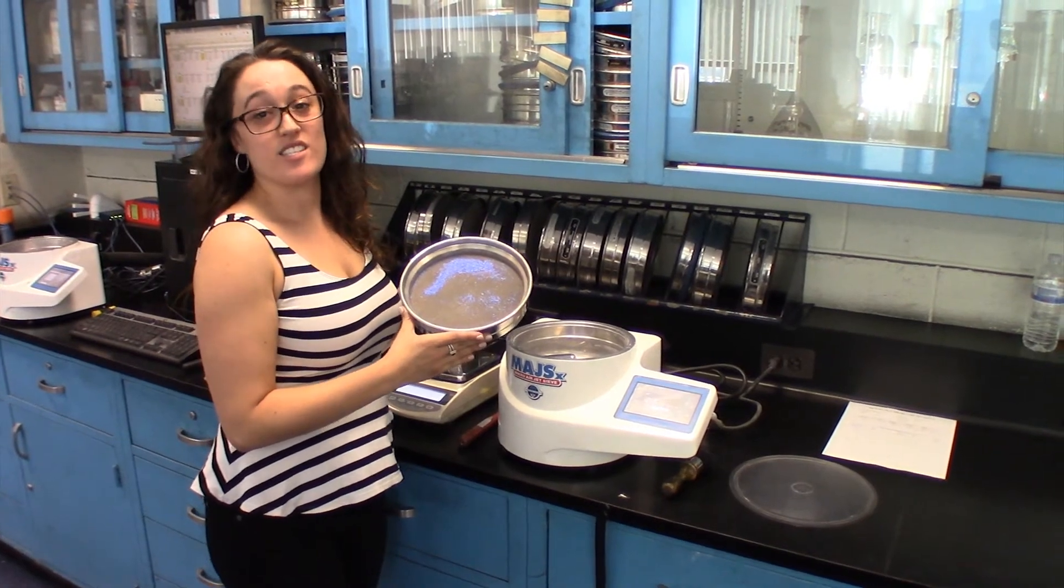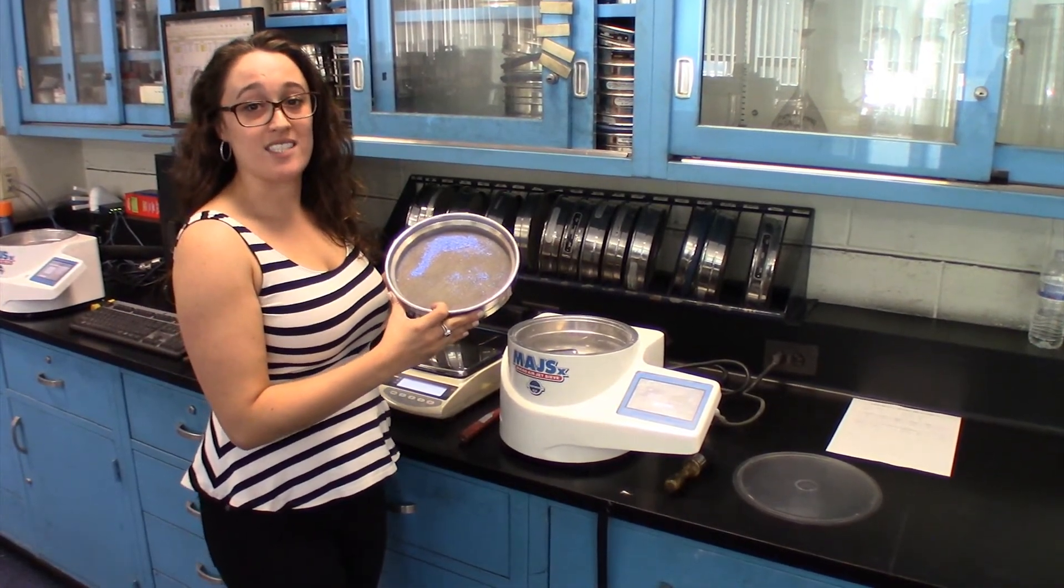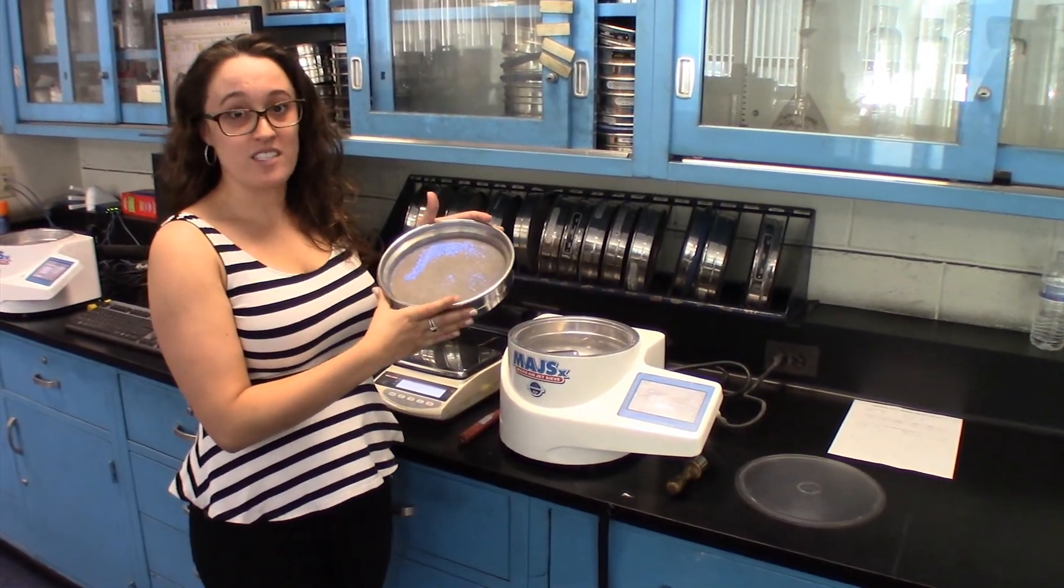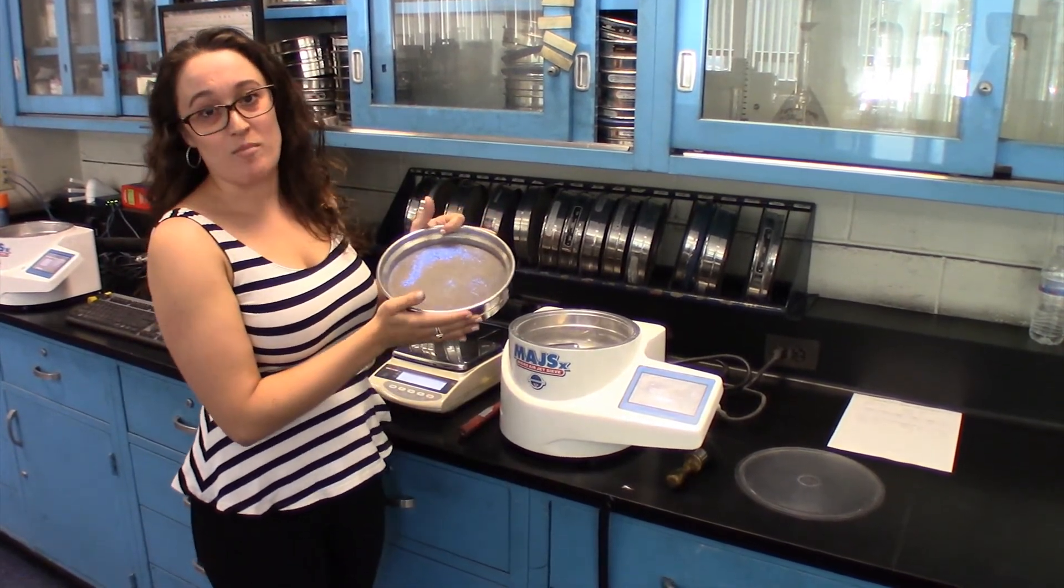Although we analyzed detergent today on the Hosokawa Micro Air Jet Sieve Model MAJSX, it is also very useful and reliable to analyze other dry powders in any field such as chemical, mineral, pharmaceutical, food, cosmetic, and plastics. Thanks.